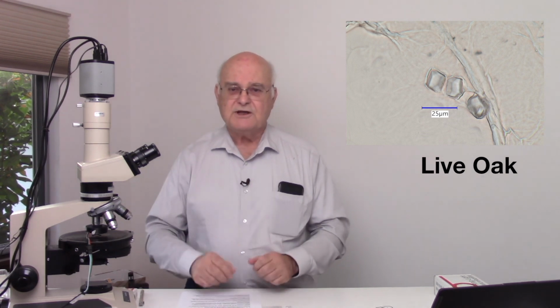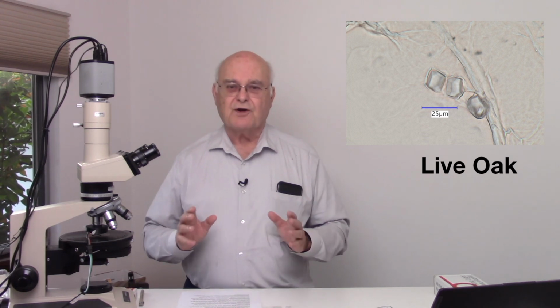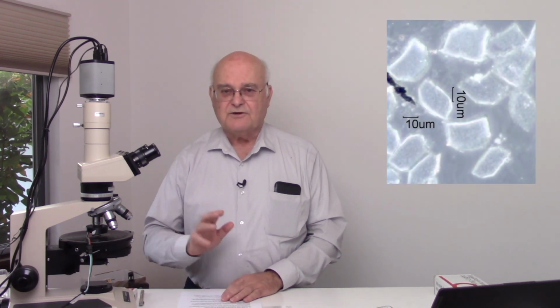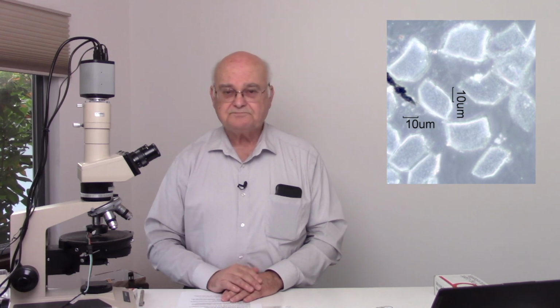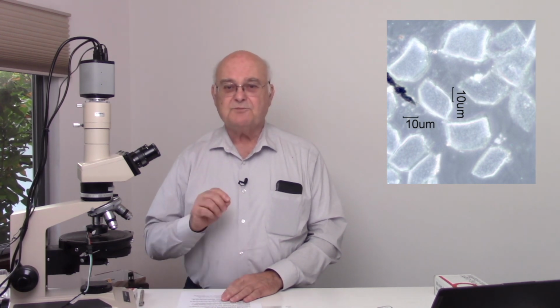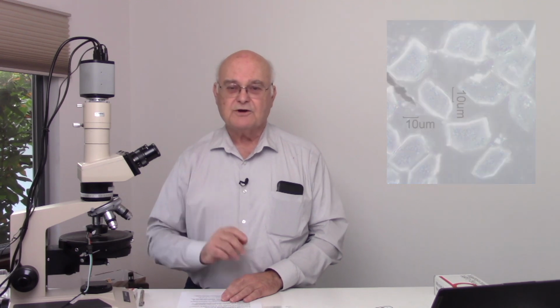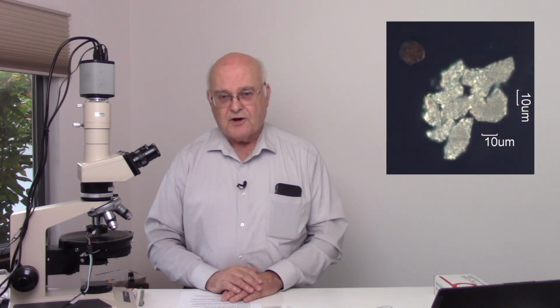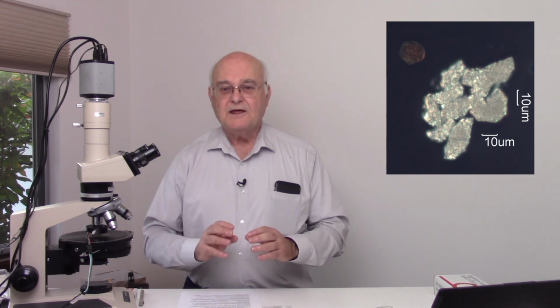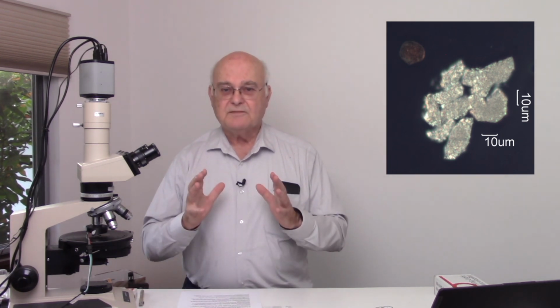Light passes through it easily. It scatters very little light. So with reflected dark field illumination, you only see the edge. The crystal itself stays clear. If it's been exposed to temperature, it becomes light scattering. When you turn on the dark field reflected light system, the particle lights up like a beacon.